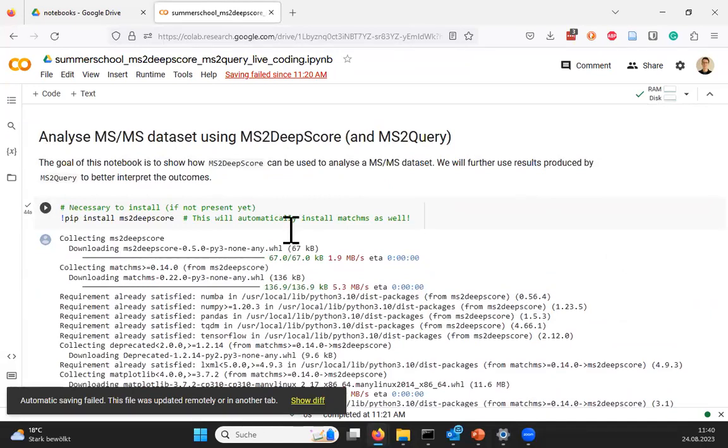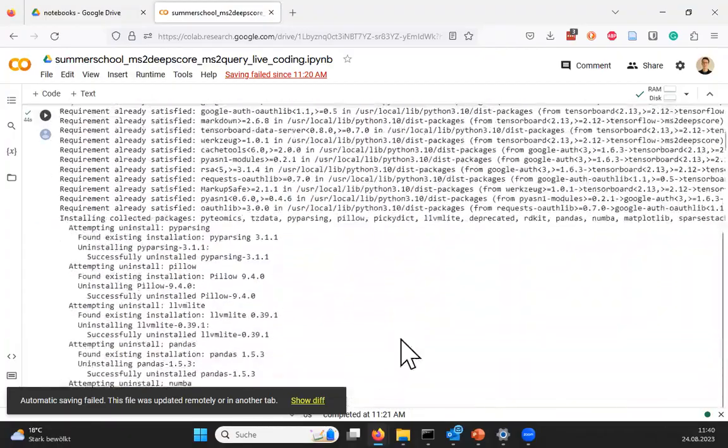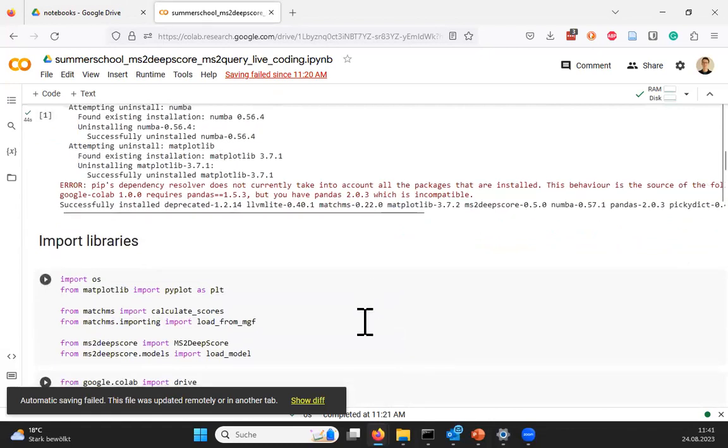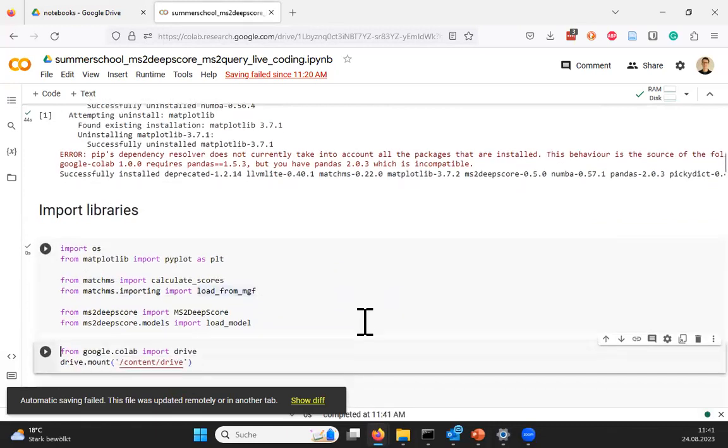It still should run in a minute or two, but it's installing these deep learning frameworks, and they are fairly big libraries. So that's why we do this in this notebook version, also because they are known to cause trouble on your local computers, but you should be able to get it to work eventually. If you install this, then this code should execute fine.